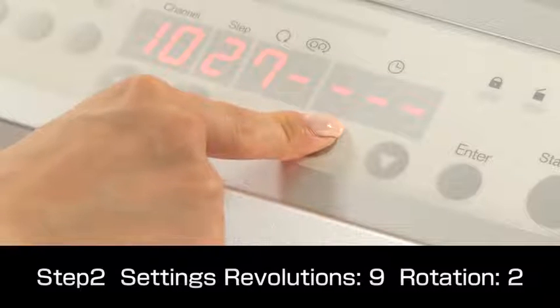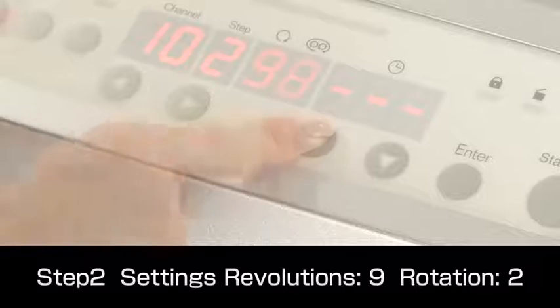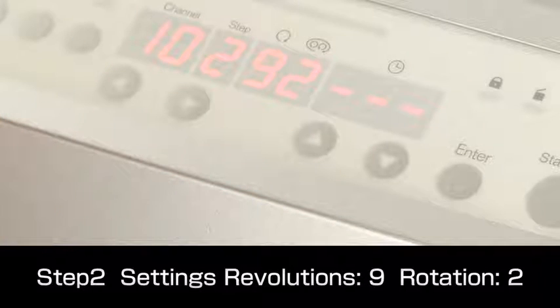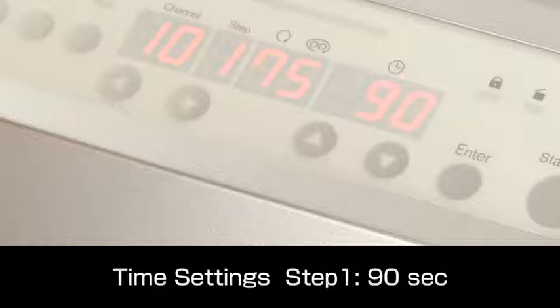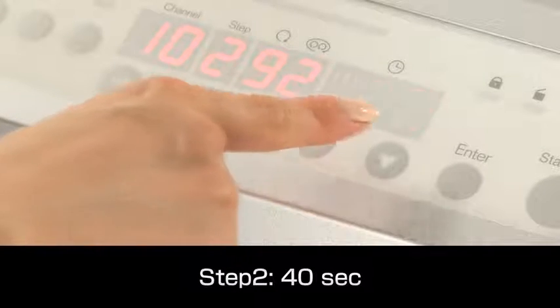Then for step 2, we set revolutions to speed level 9 and rotation to level 2 to thoroughly mix and degass the materials. The time for step 1 is set to 90 seconds, and step 2 to 40 seconds.